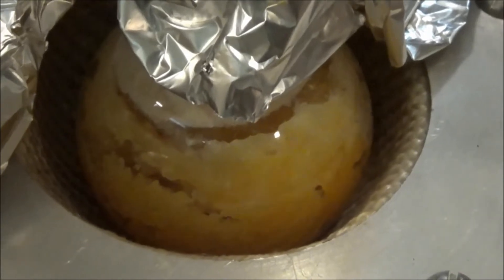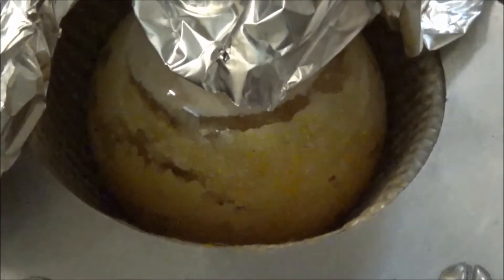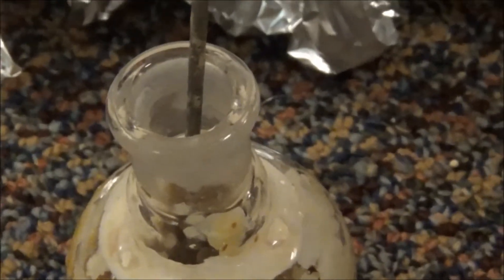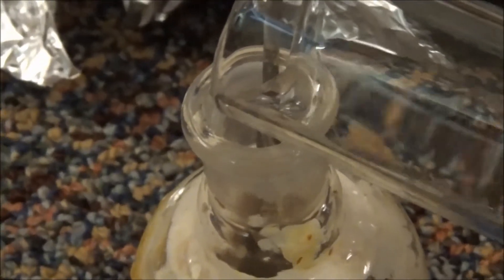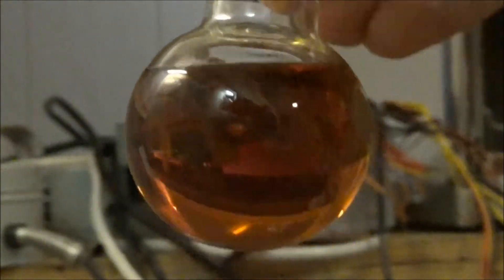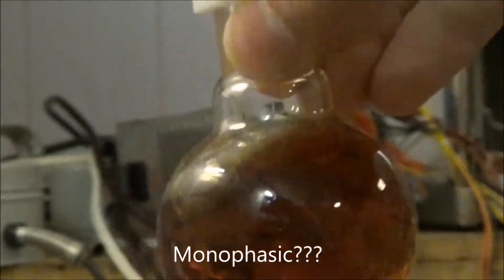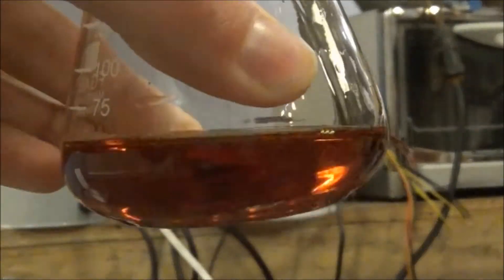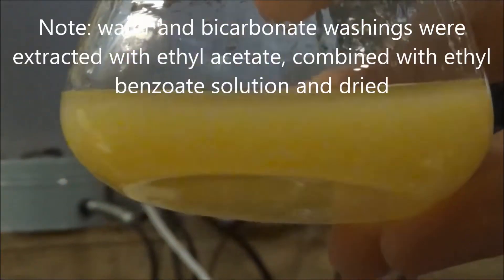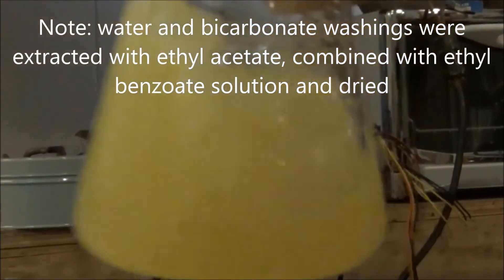This was continued until it appeared that no more ethanol was being driven off, leaving a very, very viscous mixture. I let it cool down to room temperature and poured in about 10 milliliters of water to dissolve everything. To my surprise, it left a one-layer solution — which was weird, because water and ethyl benzoate should have separated. I added a solution of 3 grams of sulfuric acid in 10 milliliters of water, and it separated into two layers. This was separated, washed with a sodium bicarbonate solution, and then washed with water.